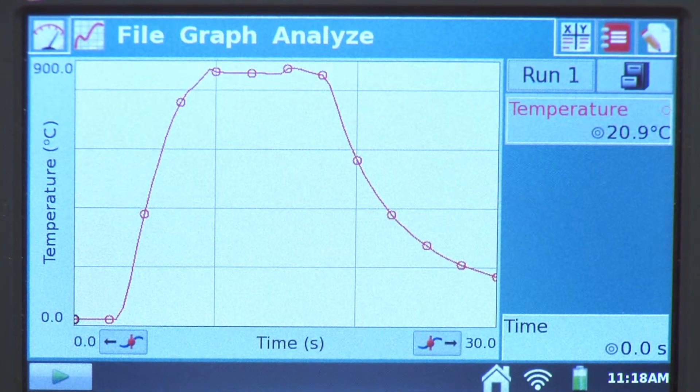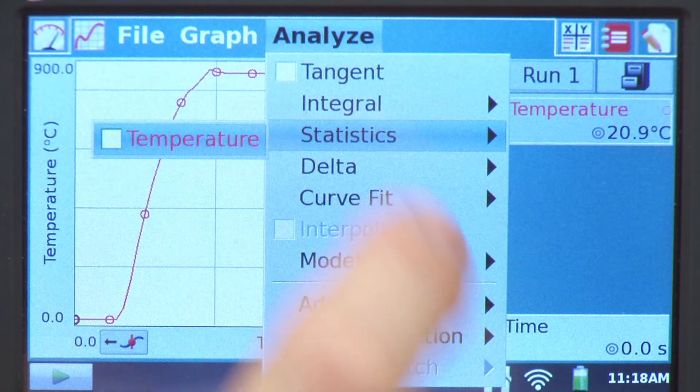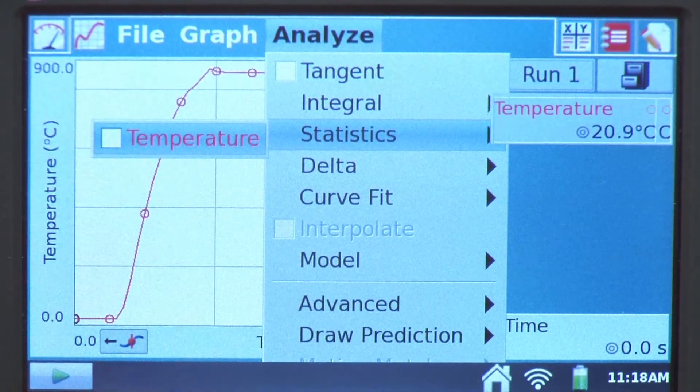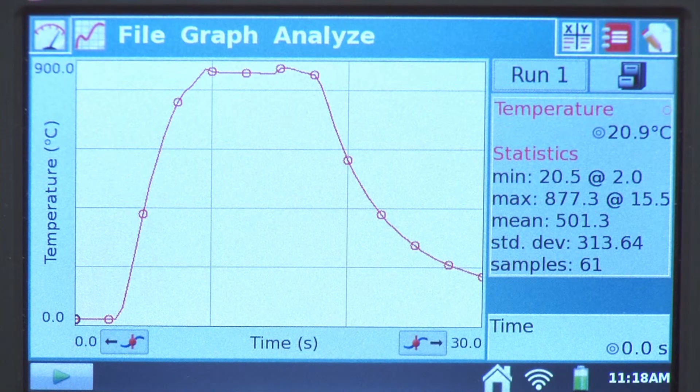For the analysis on this, we'd be interested in what was that maximum temperature — how hot was it in the flame. This is a great use of the stats function. Going to Statistics, the maximum temperature was 877.3 degrees Celsius at 15.5 seconds.